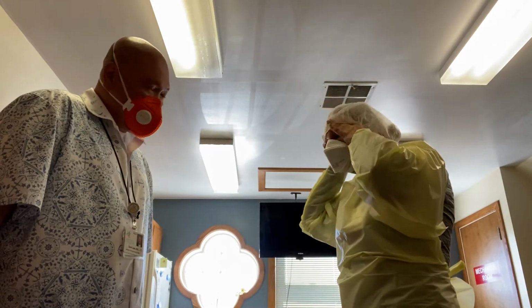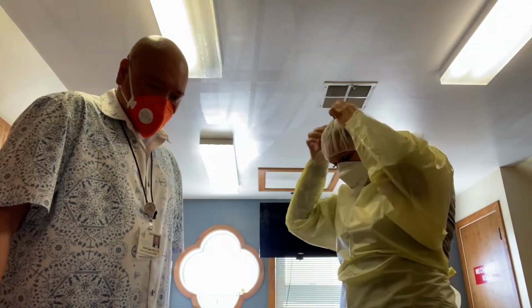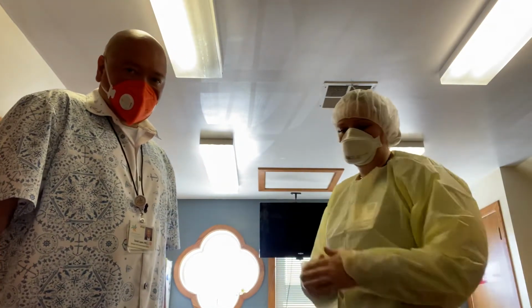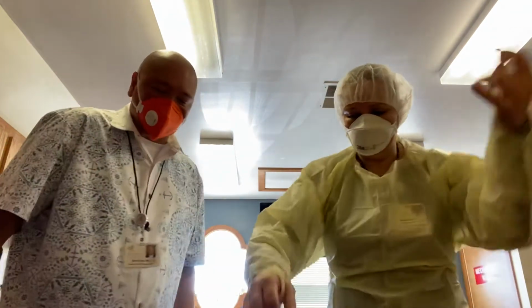Hair is a vector of transmission for infectious disease, especially ones that are suspended in the air. It can land on your hair and it can transmit to other places. The next item she wants to put on has options. Now you can put the shoe covers on, so make sure everything's done.